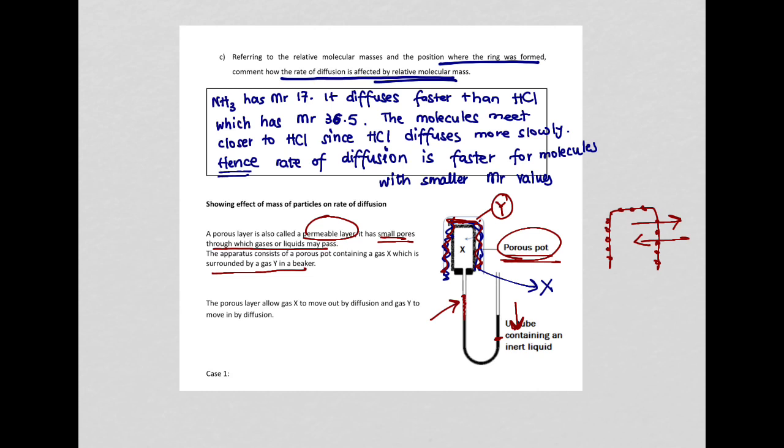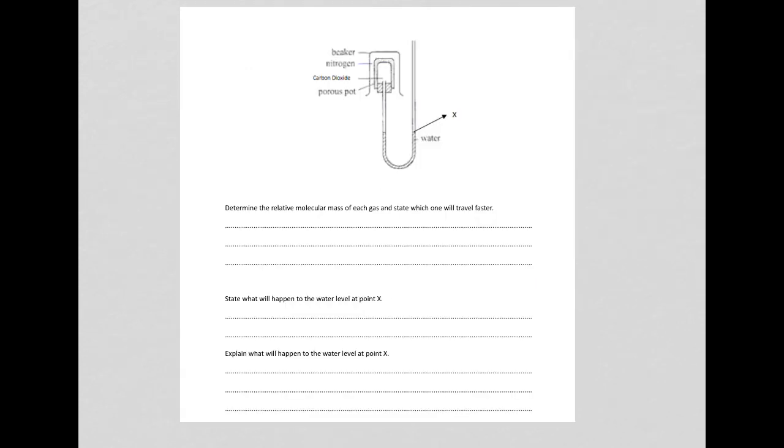Now, if the two gases move at the same speed, at the same rate, then there is no difference in pressure, so the level of liquid here does not change. It stays the same. Let's see this in action.